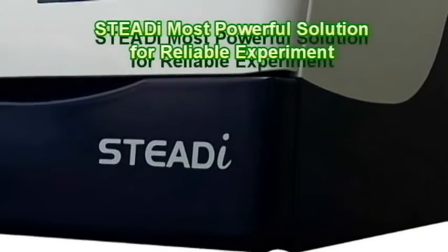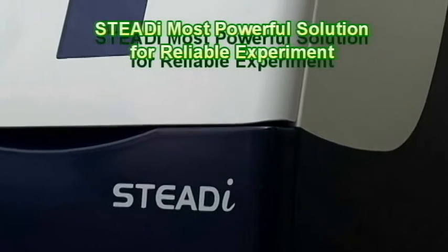Presenting Steady, the most powerful solution for reliable experiments of automated nucleic acid extraction.